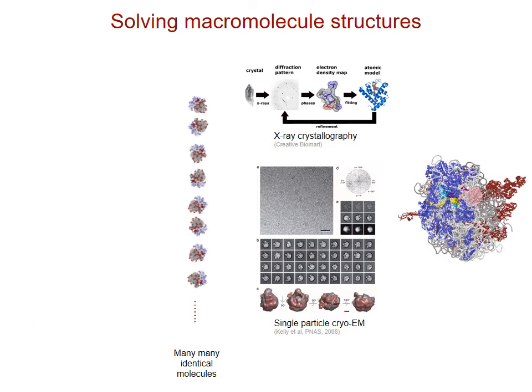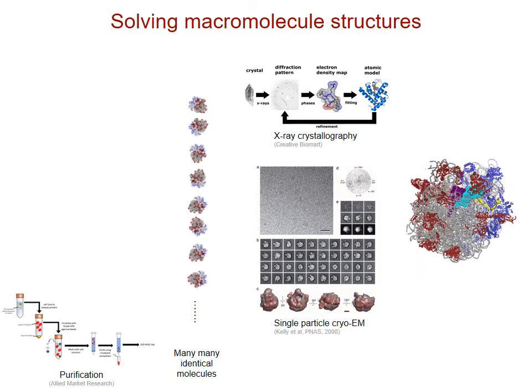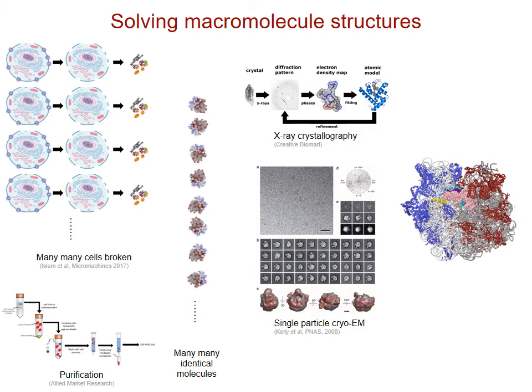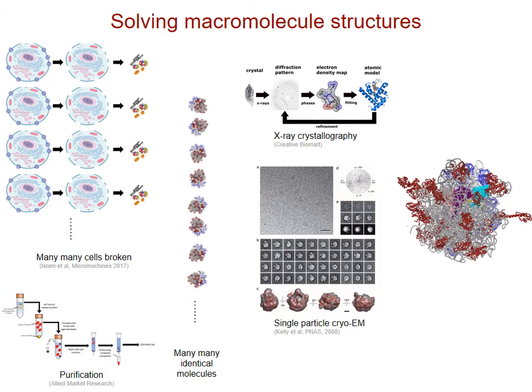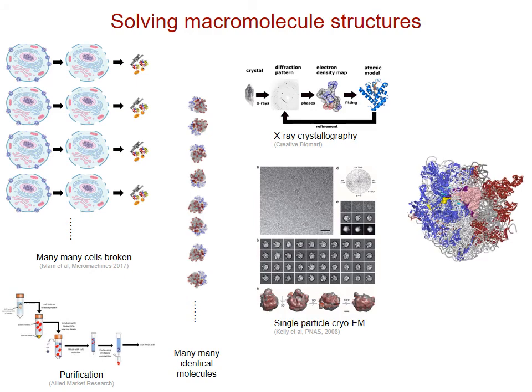And these macromolecules are obtained through a purification process. The input of this purification is the cell extract obtained by breaking many cells.